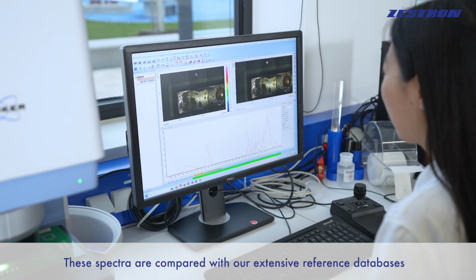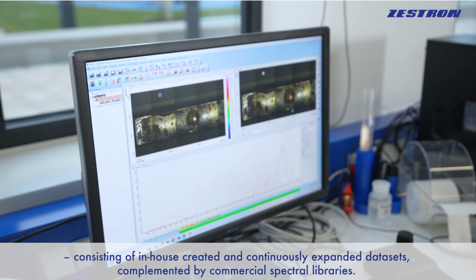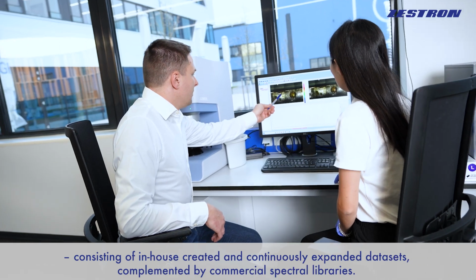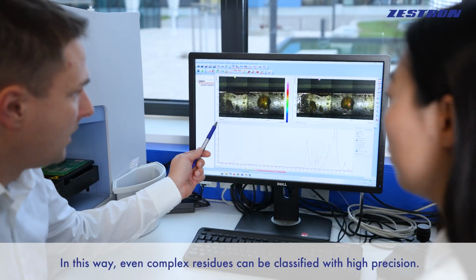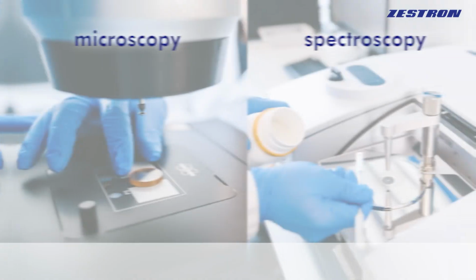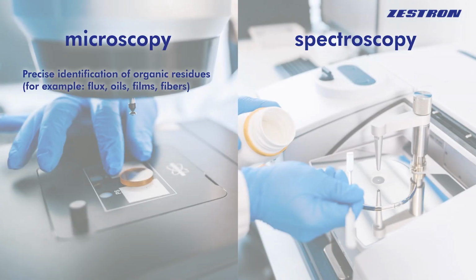These spectra are compared with our extensive reference databases, consisting of in-house created and continuously expanded datasets, complemented by commercial spectral libraries. In this way, even complex residues can be classified with high precision. Your benefits: precise identification of organic residues, for example flux, oils, films, and fibers.